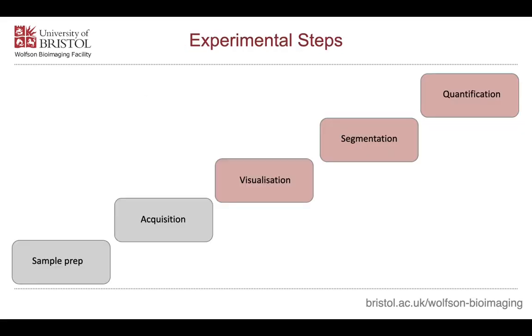So where do we start? Well, we've got to start, unfortunately, right at the beginning, because this is an introductory course, with the experimental steps. If you want to get to good quantifiable, good quality data, each of these steps builds on the previous one. So you've got to start all the way down at the bottom of the ladder, all the way down at sample prep. So you've got to get good sample prep.